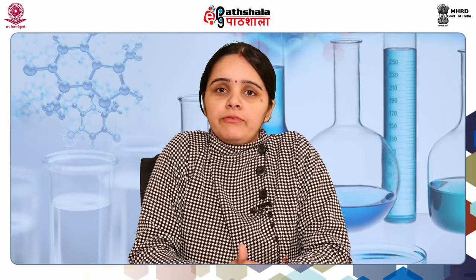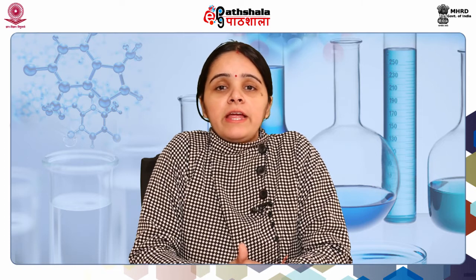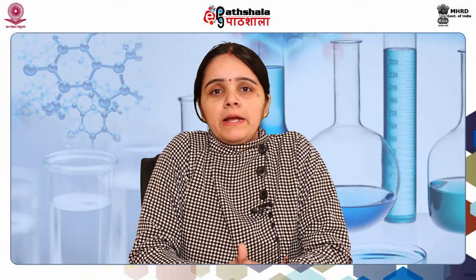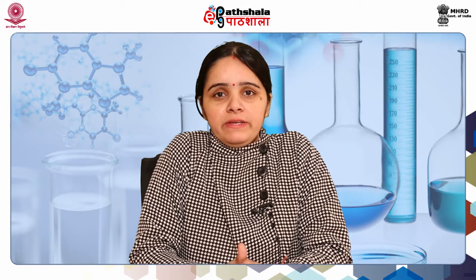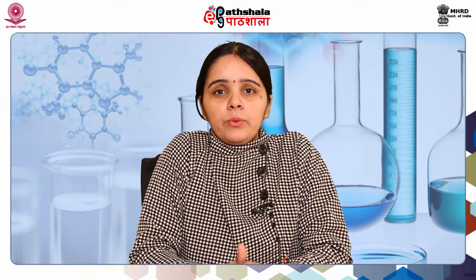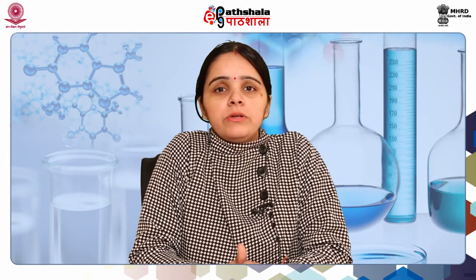What is chromatography? Chromatography is a general term that is applied to a wide variety of separation techniques based upon the distribution or partition of sample molecules between mobile and stationary phase. The mobile phase can be of two types, either gas or a liquid, and the stationary phase also can be of two types, either liquid or solid.